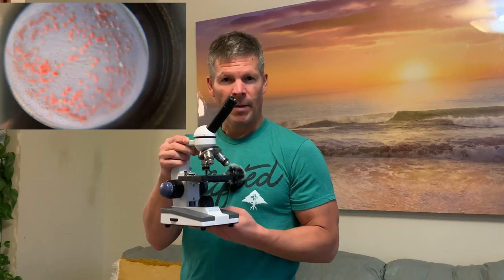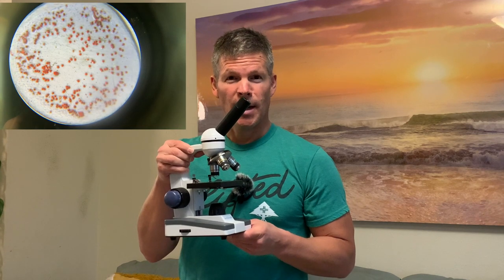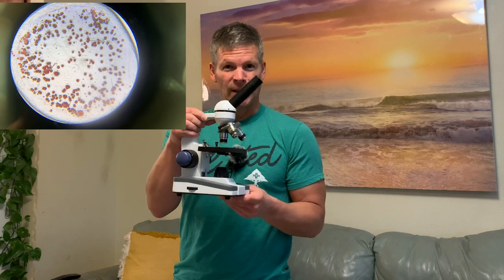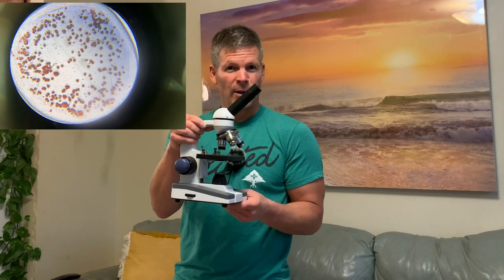Today I'm going to be doing a quick review of this Amscope microscope, the model M150C-1. We're going to see how to use it and I'm going to show you some images I took with my phone camera. They're not great but they show you some of what you can see with this type of microscope. Hopefully it'll help you decide if this particular microscope is good for you and your family or you and your kids.